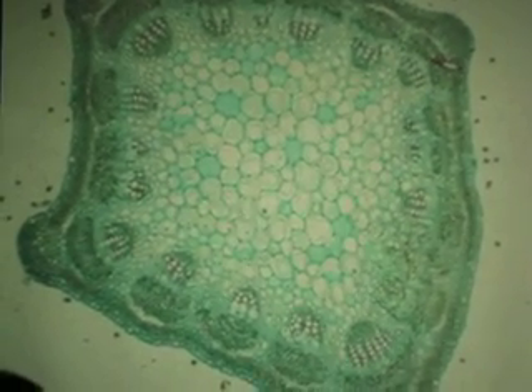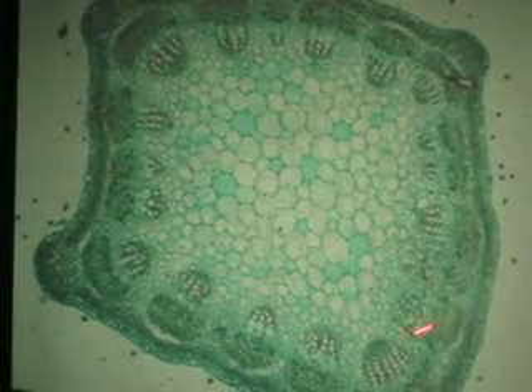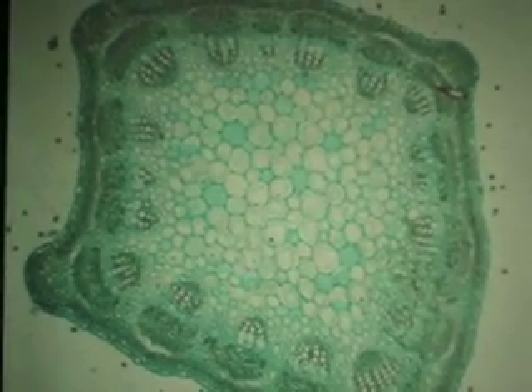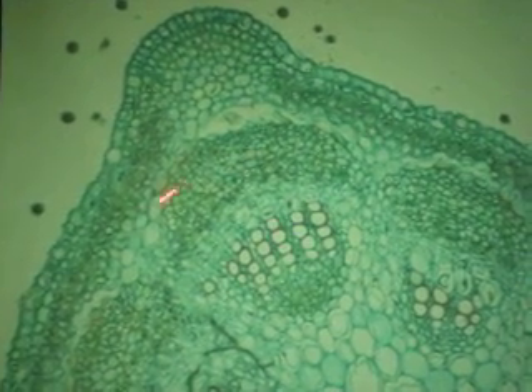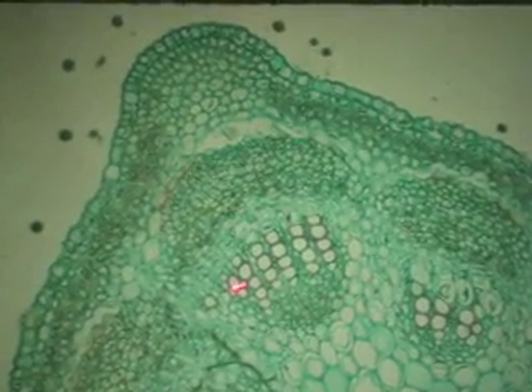Number 7, dicot stem. How do you know it's a stem? We've got multiple vascular bundles. How do we know it's a dicot? There is a pith in the middle. The bundle cap is sclerenchyma — even though it's stained green, it's sclerenchyma. And then we have the xylem here and the phloem here. The phloem is external and the xylem is internal.